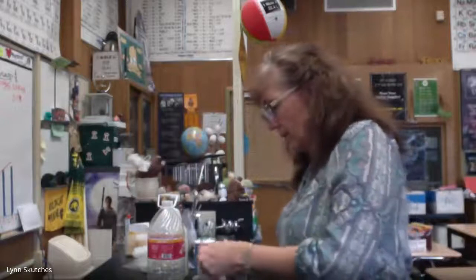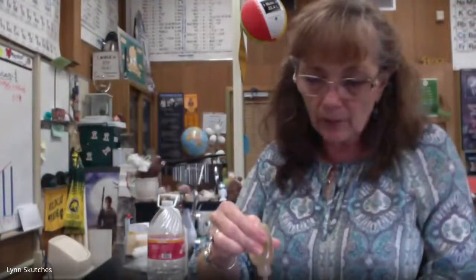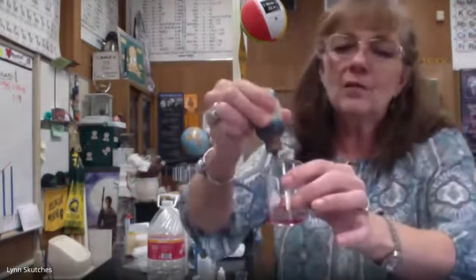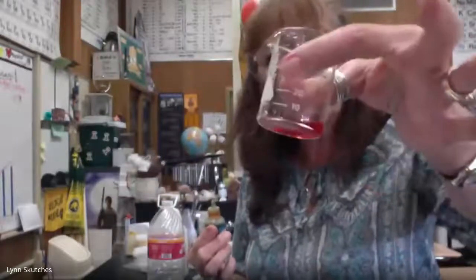The other two substances I just want to show you. This is a bottle with hydrochloric acid in it, and hydrochloric acid is the acid in your stomach that helps you digest your food. Just pouring a few drops of this in here. And when you look at it, it looks like water. It doesn't look like anything. When it gets on a cut, it does look very different though. So if I put some universal indicator in that clear, colorless liquid, I have red. Okay, that tells me it's an acid.